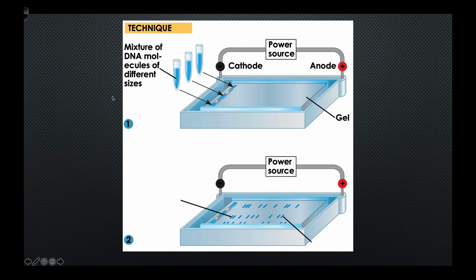So this is what a basic gel electrophoresis unit looks like. You can see this is nothing more than an electrical box. You can see the cathode on the left-hand side, and this is a wire that basically drops down into a fluid here, and it's negative in nature, which means it emits electrons from it. And over here we have a positively charged pole. This is your anode, and this is going to collect those electrons that go from left to right over here, okay?